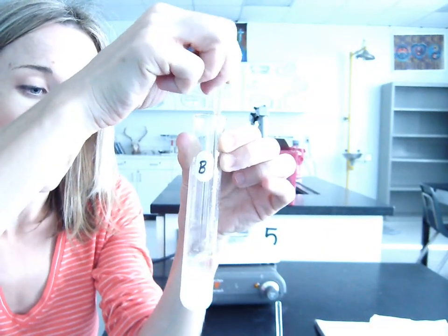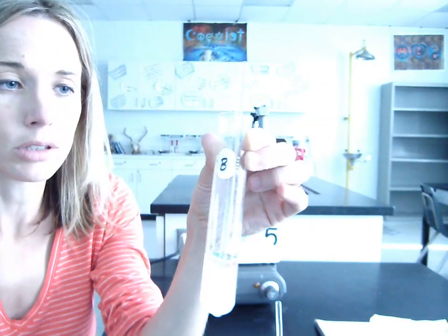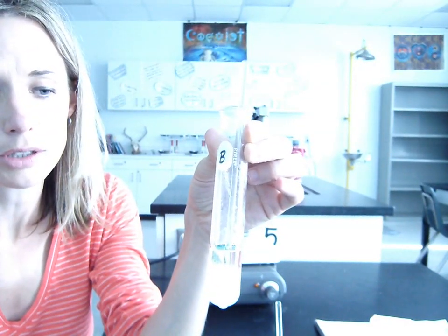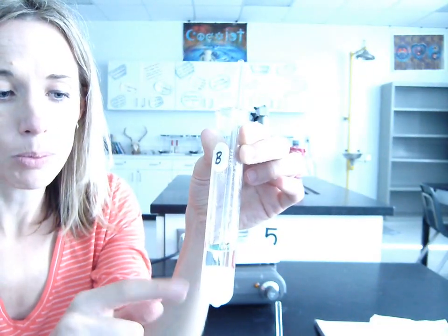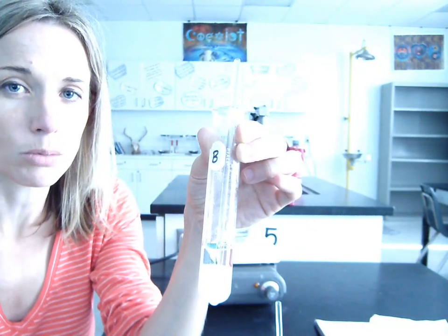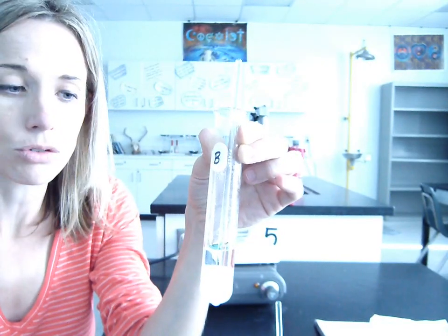So anyway, substance B is definitely affected by temperature with regards to its solubility in water. At room temperature, it's not very soluble. When you heat it up, it becomes significantly more soluble. When you bring it back down again, all that stuff will come right back out of the solution.